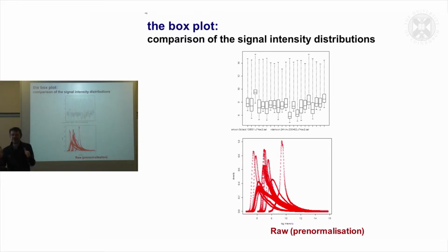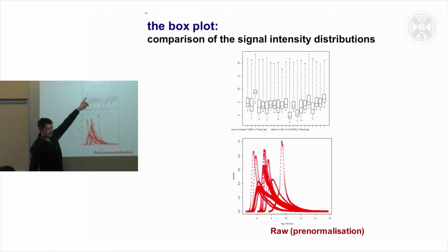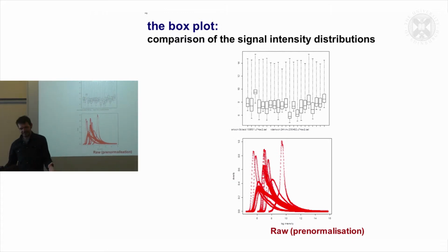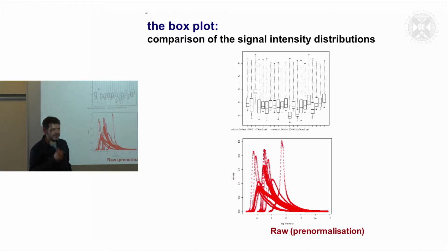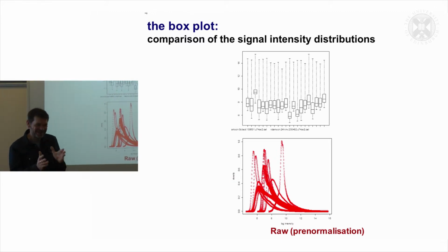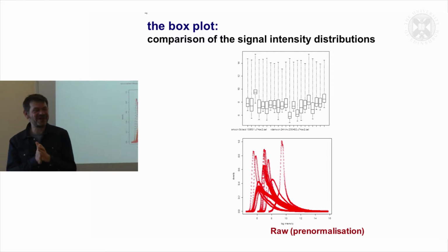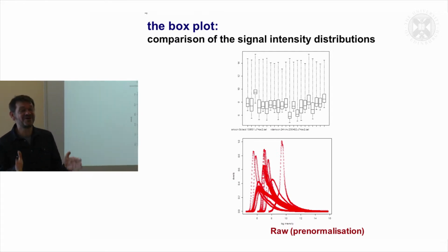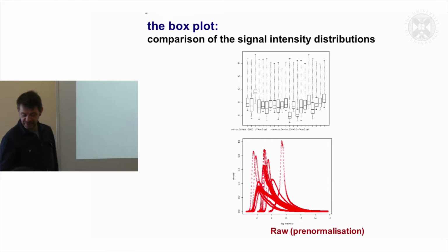So the first thing to do is get any data set and have a look at the box plot, because instantly if you see something like that, that's going to be dodgy data and you need to get rid of it. I think what becomes harder is when you start saying, well, I really want to keep that sample. It's quite important. There is a kind of emotional value. When you've just spent a lot of time generating samples, you get emotionally attached to them and you don't want to throw them away. But ultimately, you've got to be quite harsh about this. We'll generally run something called array quality metrics, and that gives you a statistical value for throwing stuff out. So you leave it in, that's fine, but that's what you'll see within BioLayout when you see it.